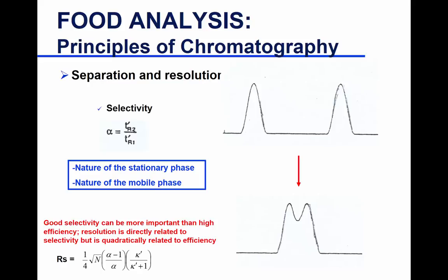So you can choose a pH that alters the charges or the density of the charges on your stationary phase. By altering the density, you are actually changing the selectivity. Okay? So you can control this attribute here. Some of it is based on the type of stationary phase you choose. Other is the type of the mobile phase. So you can adjust the mobile phase to influence selectivity.